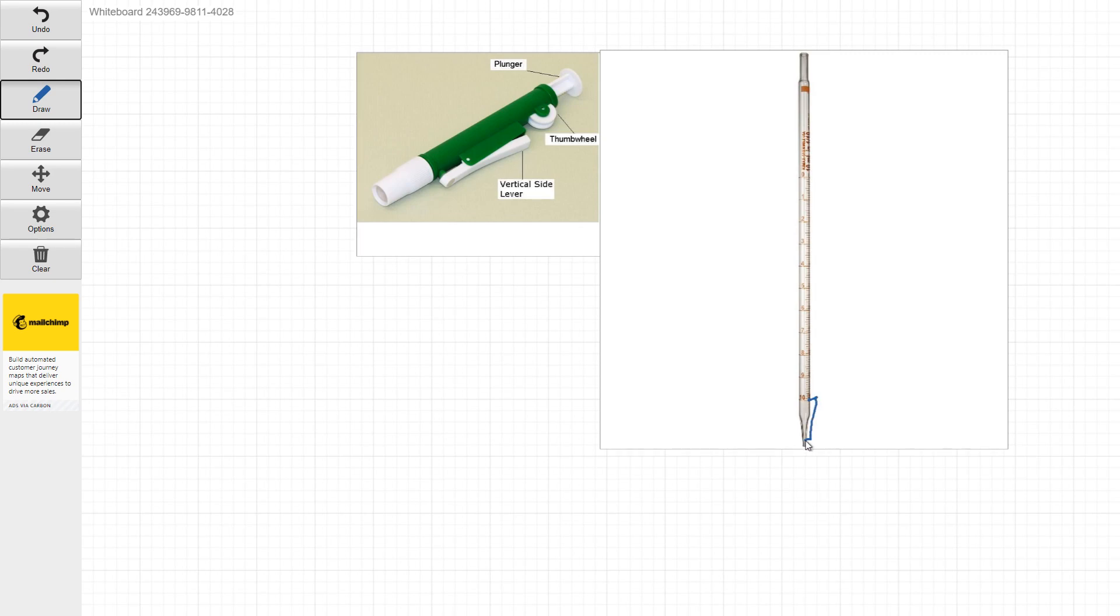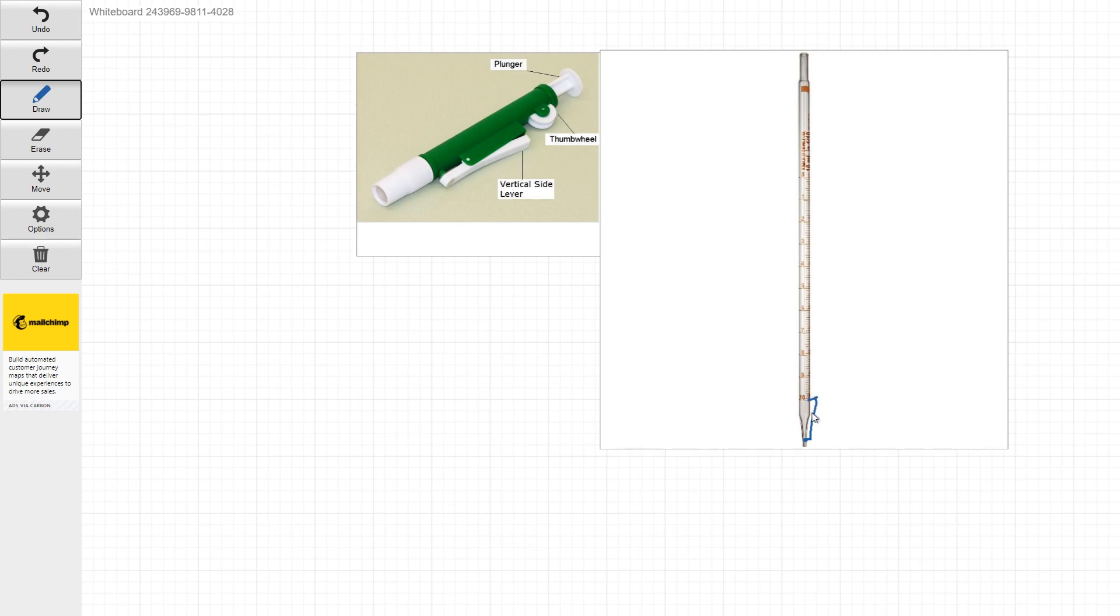This area here doesn't have any markings on it. So the rest of this has markings on the way down. This tip doesn't. So if you needed to dispense 10 mils from this tip, and you're at the zero, you go from the zero to the 10. You don't dispense this tip here because it's uncalibrated.